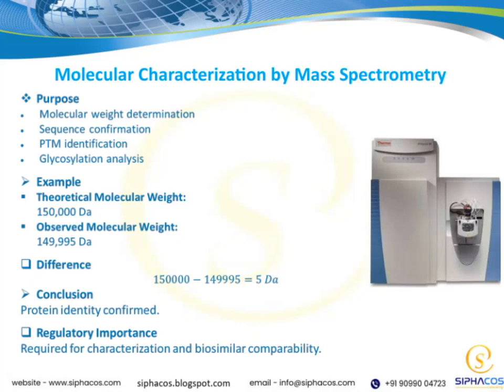Let's dive into molecular characterization using mass spectrometry. This technique lets us identify and analyze molecules by measuring their mass with incredible precision. It's like giving us a detailed fingerprint of the molecules in a sample, revealing their structure, composition, and even subtle differences. Mass spectrometry is a cornerstone in fields like chemistry, biology, and medicine because it helps us understand complex mixtures and discover new compounds. It's powerful, precise, and essential for modern molecular science.